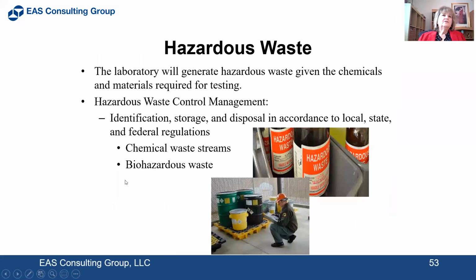It's important for the laboratory to understand how they're going to generate hazardous waste, how it's going to be controlled, identified, stored, and disposed of. And you're going to do that according to your local, state, and federal regulations, which vary widely from place to place. I used to work in Northern California in the Bay Area, and there was just a simple rule. Nothing ever went down the drain. And then I moved to Colorado and found they had different rules. So right or wrong, you have to follow the rules in your jurisdiction.